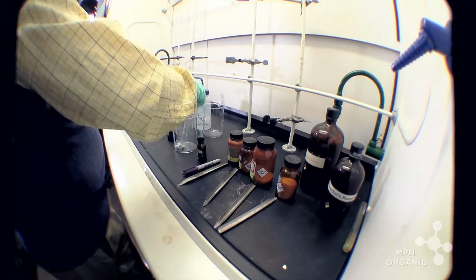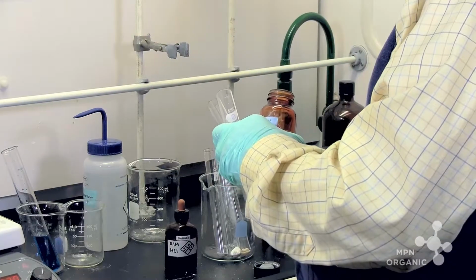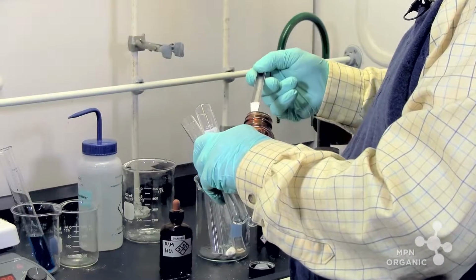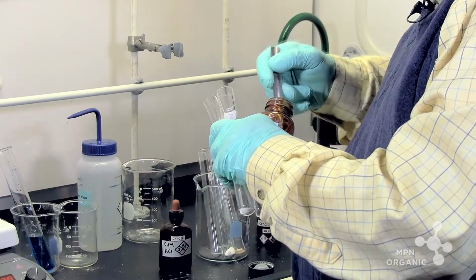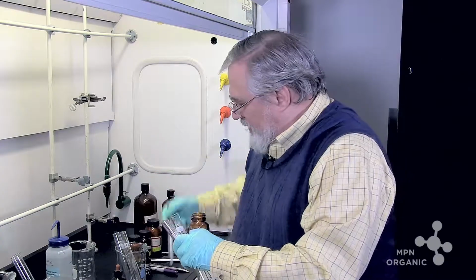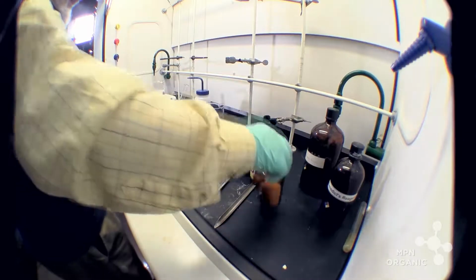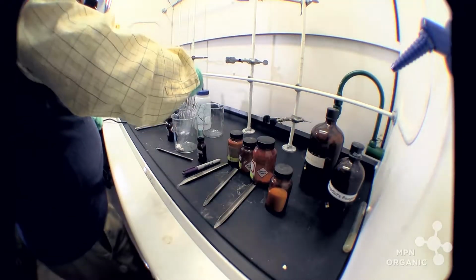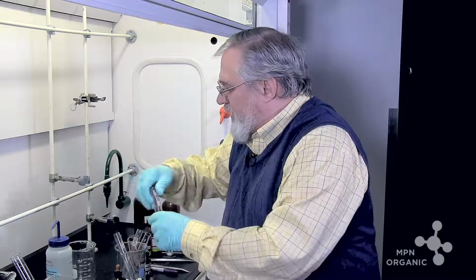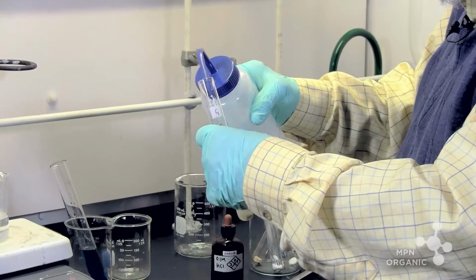And then I'm going to make 2 samples of sucrose. Now, sucrose is not like the others. Sucrose does not react like the others, as we will see. But in any event, here we go. So we've got these 5 here, and I'm going to make solutions of them in deionized water.